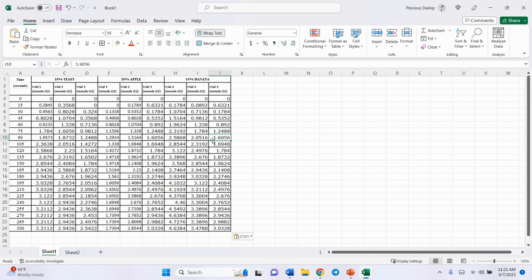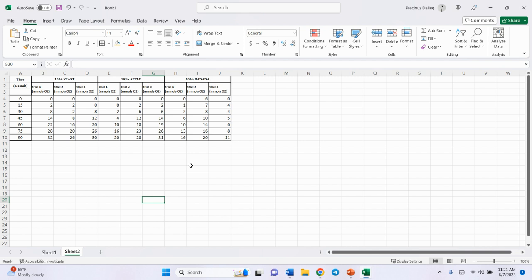The data set I'm going to work with though is a sample data. So just follow the steps and it should get you to the same type of graph, but I'm going to let you guys deal with that yourself. So here is my sample data, right? It's the same setup, just less numbers, and I'm just kind of showing you the buttons and what to click and all that stuff. So make sure you guys read the background on the topic so that you know what you're going to have to analyze and what your data means at the end of it.